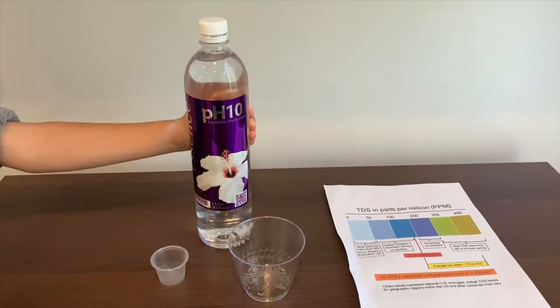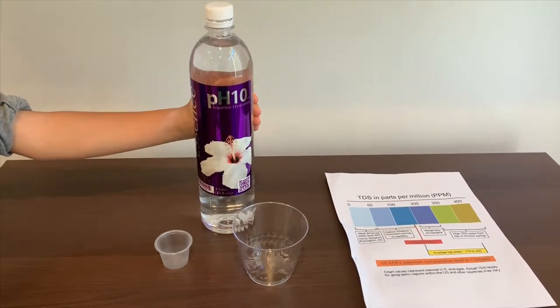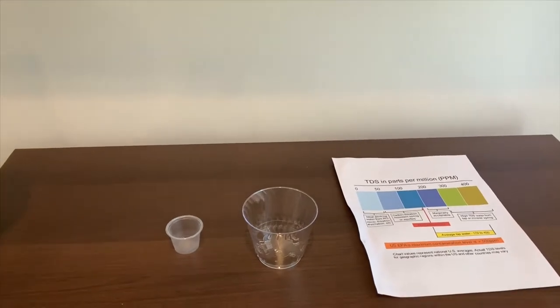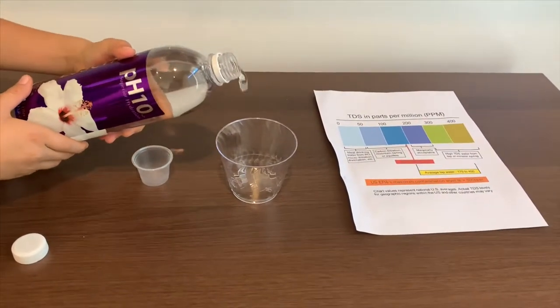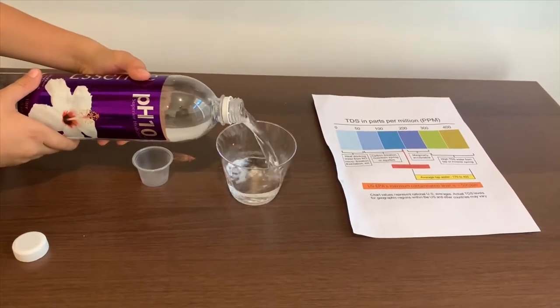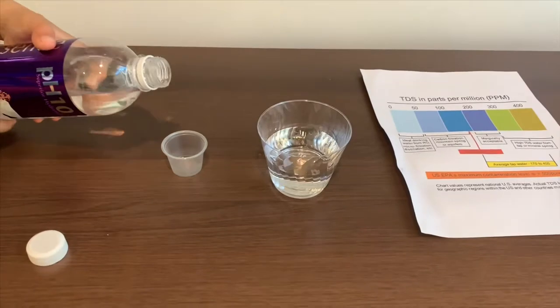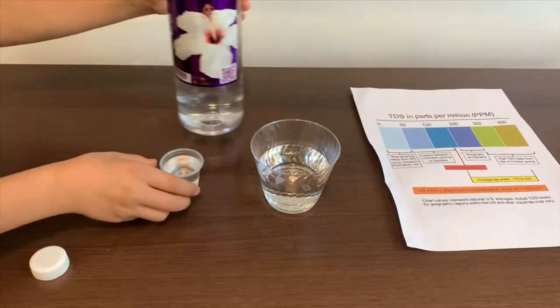This is Essence purified water. It says that the pH is supposed to be 10 — let's find out. We're going to test the TDS, then the pH. Don't put too much in the pH cup.